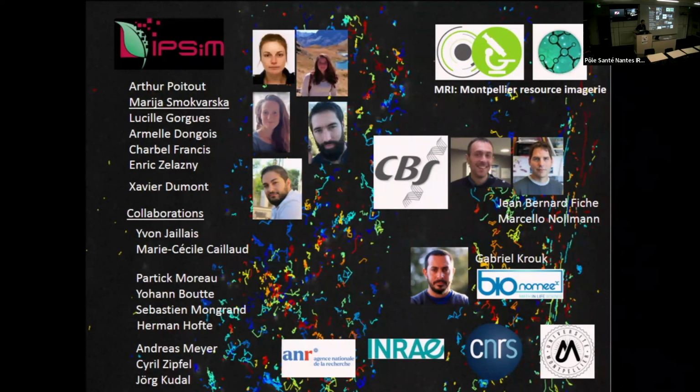So we try. From what I understand, it's quite complicated to really know if you're doing TIRF properly or not. What I can tell is that we clearly see refraction of the light of the illumination. This is really, really clear. And if you use a commercial setup, where you have something to change, and then the machine tells you you are using TIRF, then maybe it's true. We are using TIRF then.